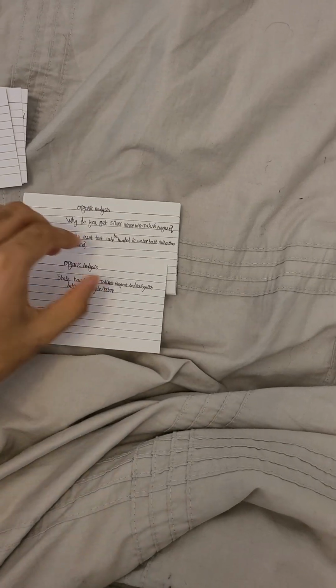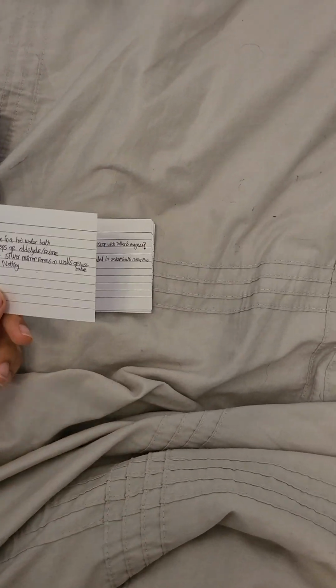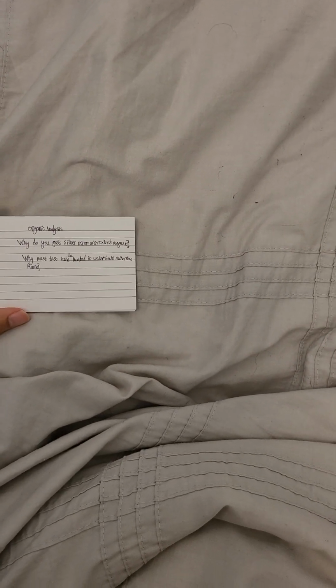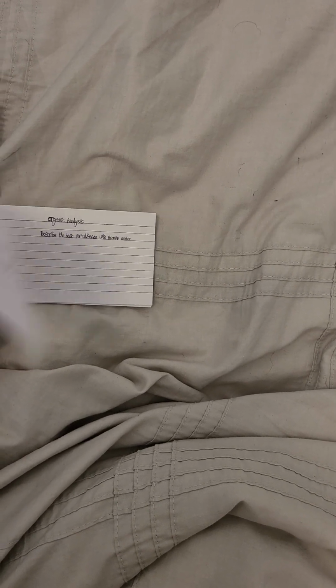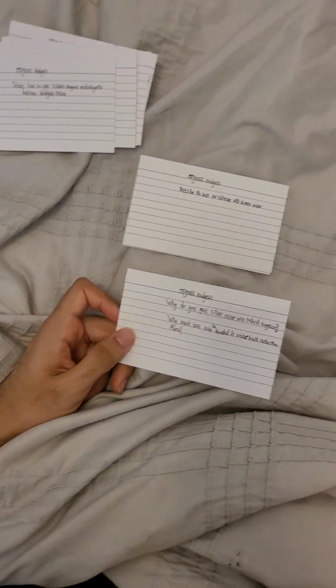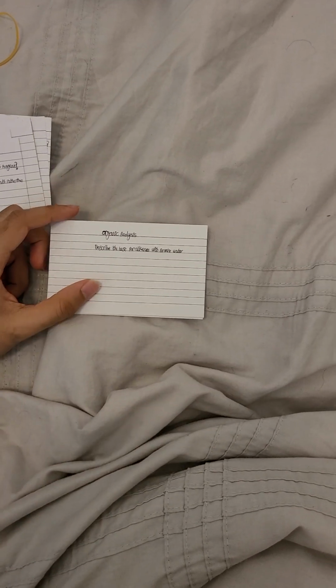Because we've already got the Tollens' reagent in the test tube, now we're going to place the test tube in a hot water bath. Add 10 drops of aldehyde or ketone. A silver mirror forms on the walls of the test tube, because the aldehyde reduces the Ag+ ion to silver atoms. Again, this came up in the aldehydes and ketones topic. Test for alkenes: bromine water.